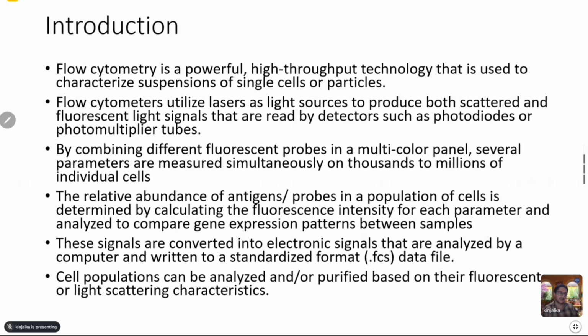So this is like a step up from your standard ELISA. In ELISA, you have one antigen, one antibody. There's an enzyme-linked immunosorbent assay, and a reaction takes place. You have a colored complex that is prepared, and based on the intensity of the color, you say, okay, this much was the amount of antigen of interest or antibody of interest.